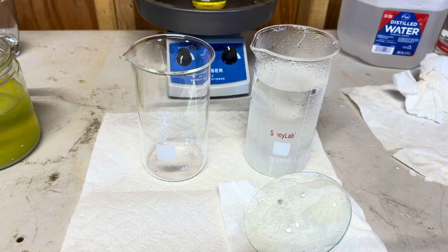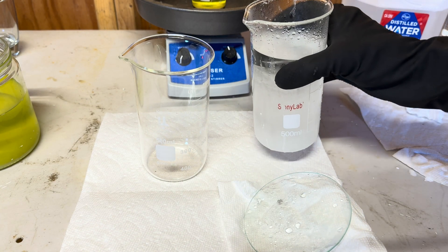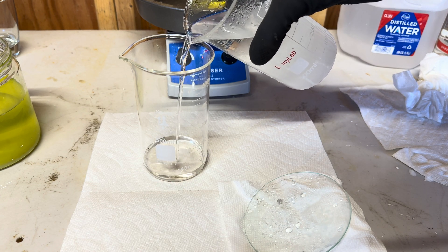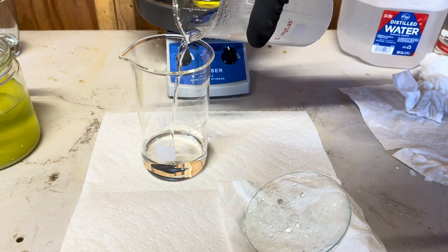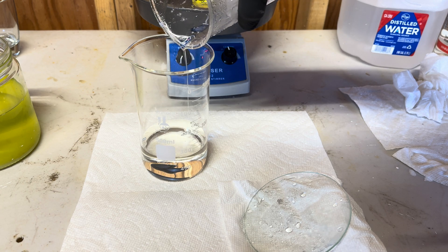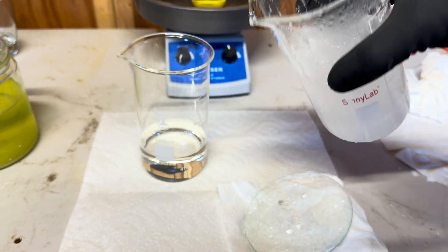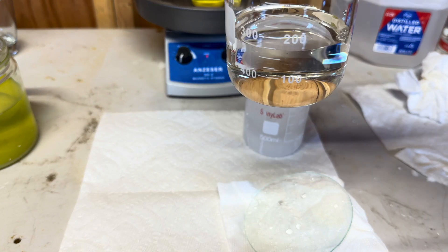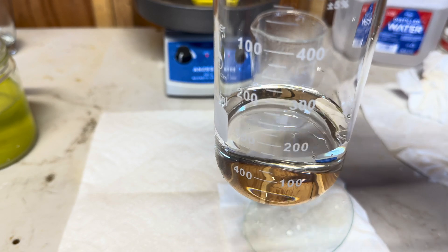It is now morning and I am going to pour our fresh nitric acid into our other beaker so we can use it for our projects. We poured out our nitric acid successfully without pouring much of the crystals into the new beaker, and we now have about 175 milliliters of fresh nitric acid.